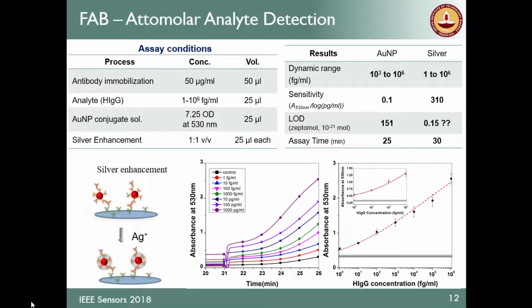These catalytic properties of gold nanoparticles are exploited, and the silver gets deposited, and then what you see is a further increase in the flow. At the end of 20 minutes, we washed it. That's how you see a bump here, a dip here, and then the silver enhancer solution. Probes are exposed to the silver enhancer solution, and then we see an increase in absorption. And now we see this surprising result, and the reviewers have asked us to go back again.